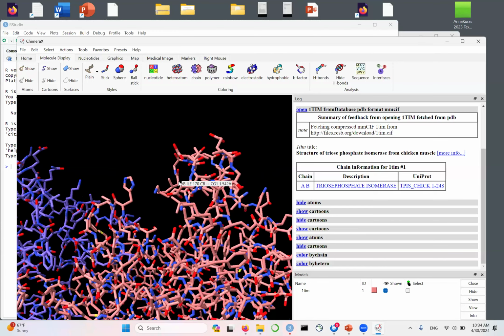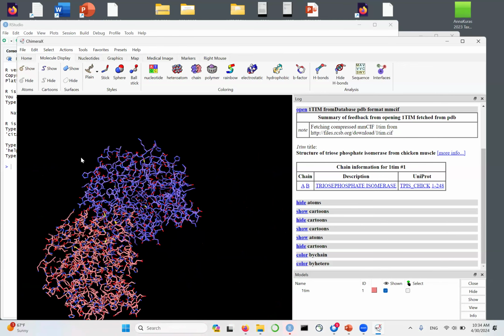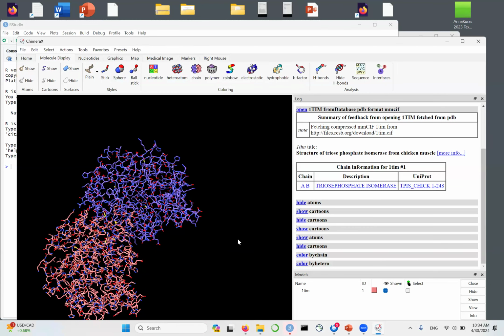Okay, now let's zoom back. Now here I went and got the molecule by going to file and fetch by ID, and I did get PDB. Okay, this is what is stored in the individual record in a database. Those records might correspond to whatever is actually biologically relevant combination of chains, but it's not always the case. It could be that whatever you see in PDB is what's reported by crystallographers, and they might report a different combination of chains as an initial record.